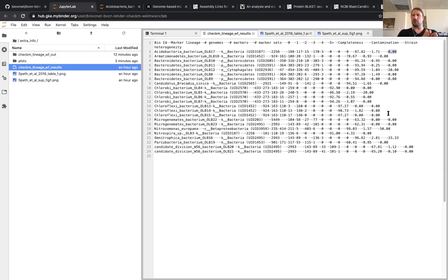If those 2 genes are more than 90% similar, it will count as strain heterogeneity. I am not entirely convinced that terminology is sound, but it is the terminology that CheckM has chosen. So we see that, for example, here is a strain heterogeneity of 50%. There have been 6 genes that are present twice. So 3 of those 6 genes in this Nitrosomonas organism are more than 90% identical to one another.